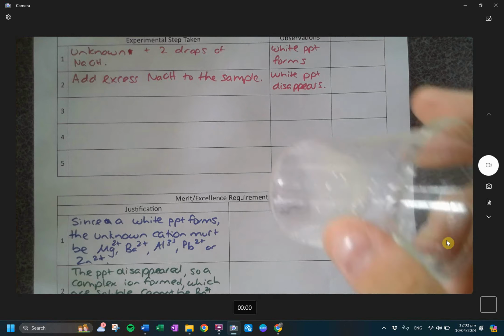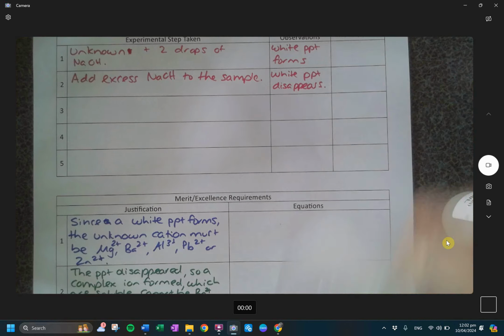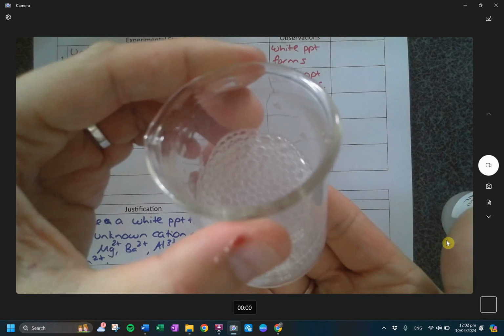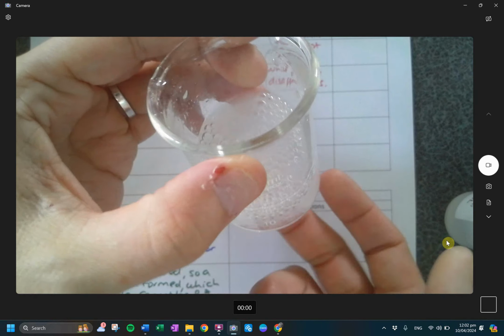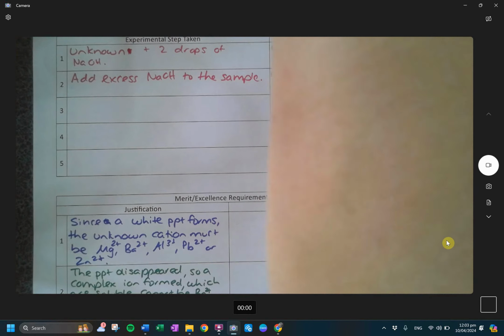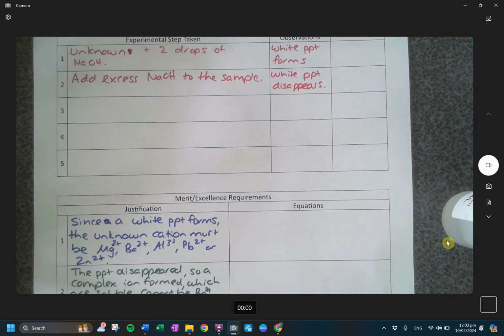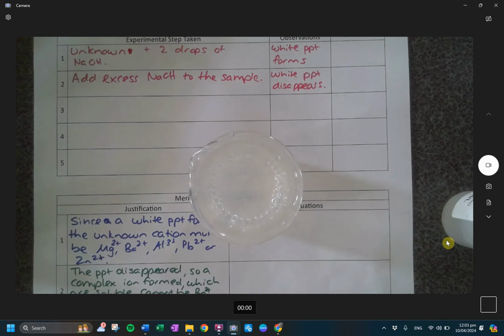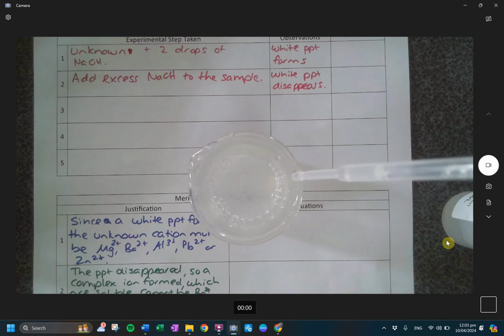Well, now I've managed to see. So that's the zinc ion with it. And now I'm just going to squish a lot of ammonia in there, so hopefully it dissolves with time. All right, not really dissolving yet. So what I'm going to do then, if I get in this situation, is take another beaker. I'm going to rinse this one out. So do you remember how I said sometimes you can get into this problem where you don't get the ratios quite right? And then the ion stays there? Grab another pipette. Take a small amount out so that way you can play with the ratios.